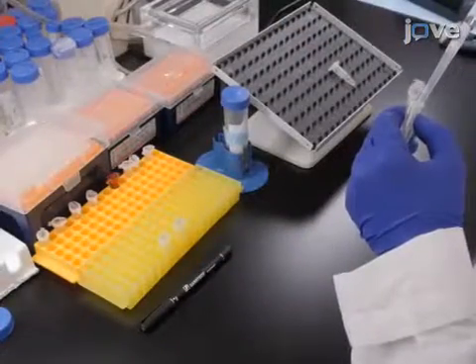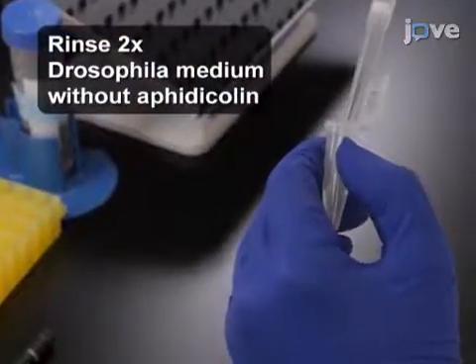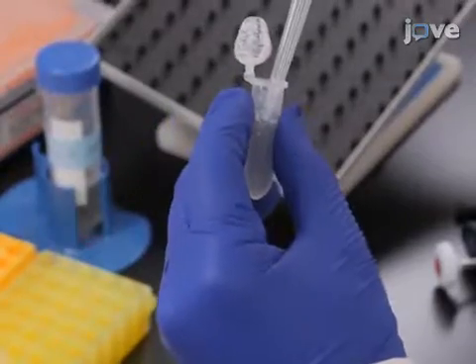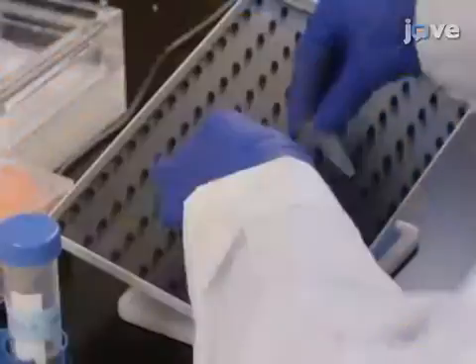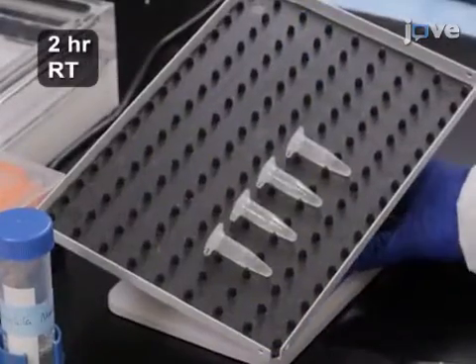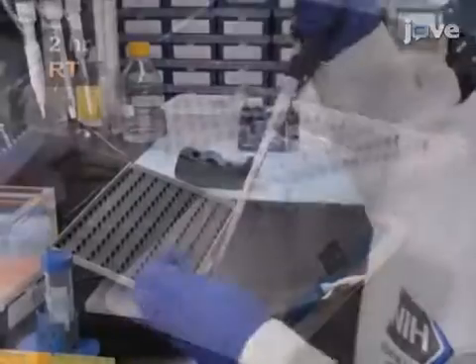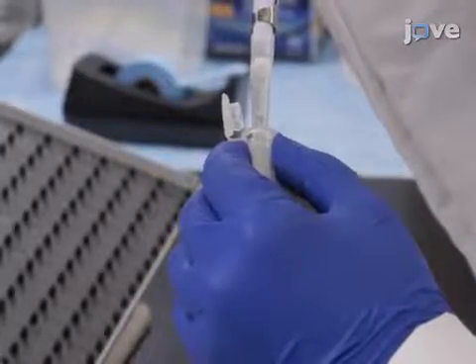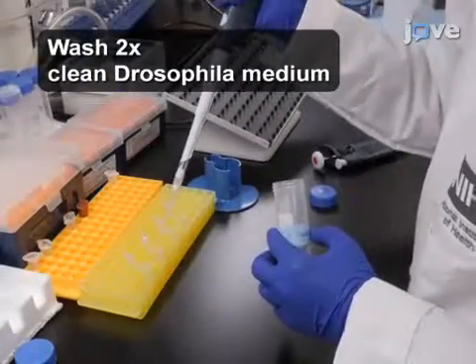Remove the medium from the ovaries and rinse briefly with fresh Drosophila medium 2 times. Add 1 milliliter of medium containing 10 micromolar EDU and 7 micromolar aphidicolin and incubate the ovaries at room temperature for 2 hours with gentle rotation. Finally, remove the liquid containing EDU and aphidicolin and wash the ovaries with clean Drosophila medium twice for 3 minutes each.